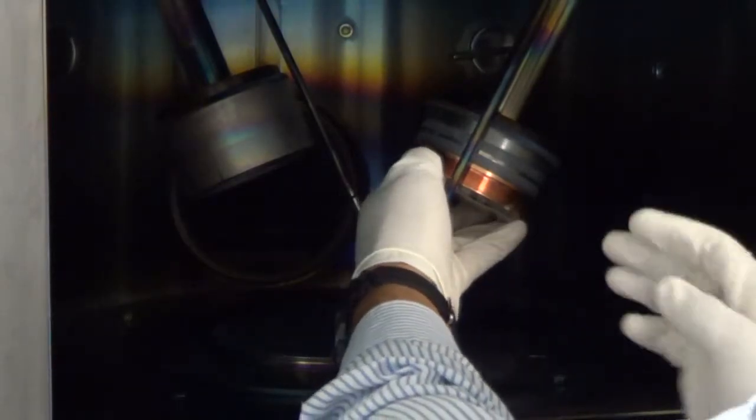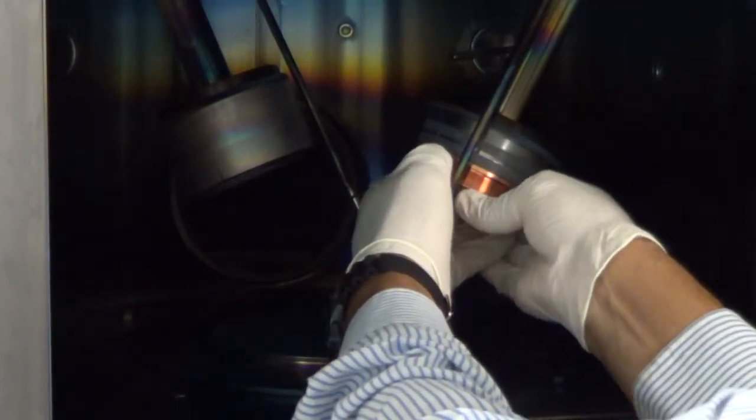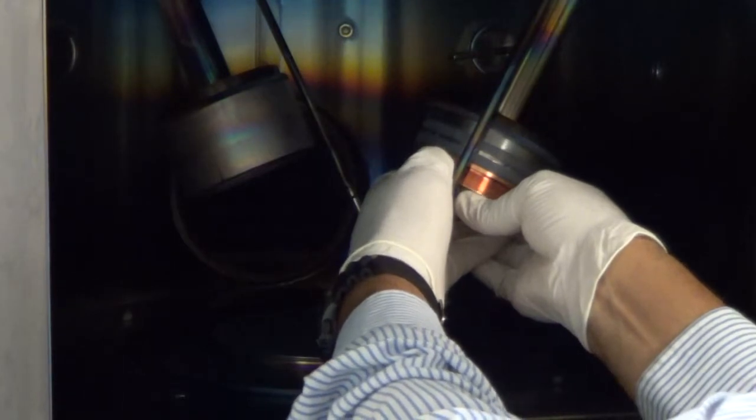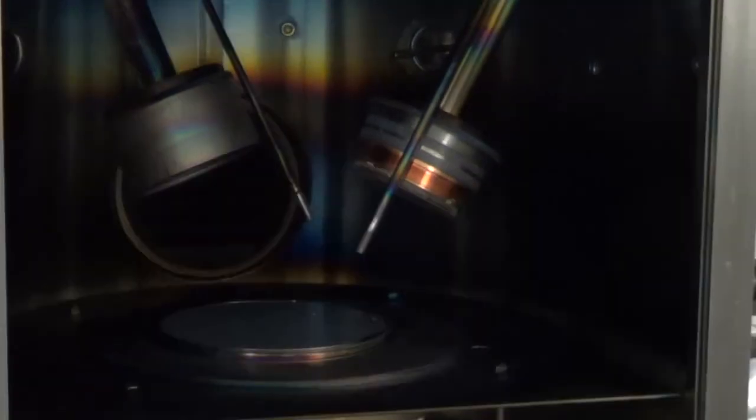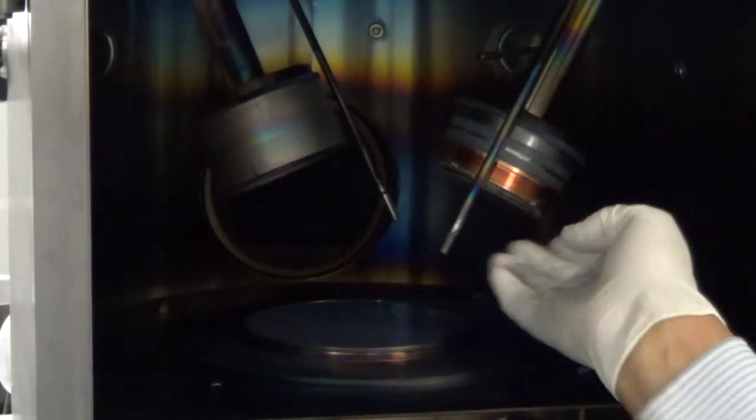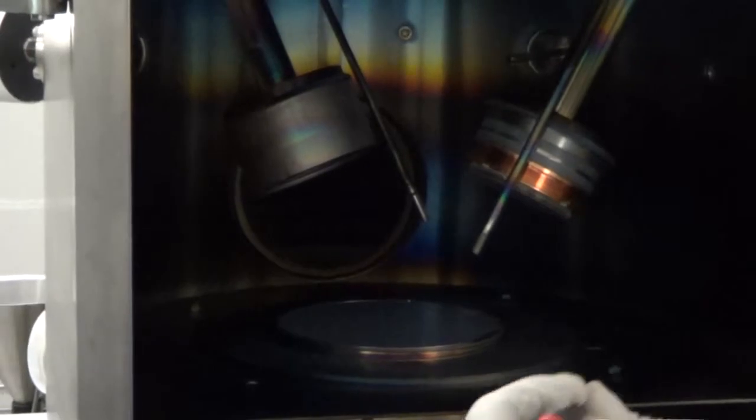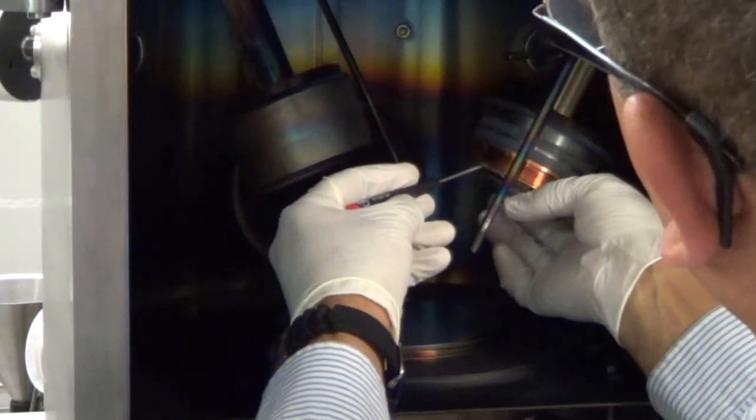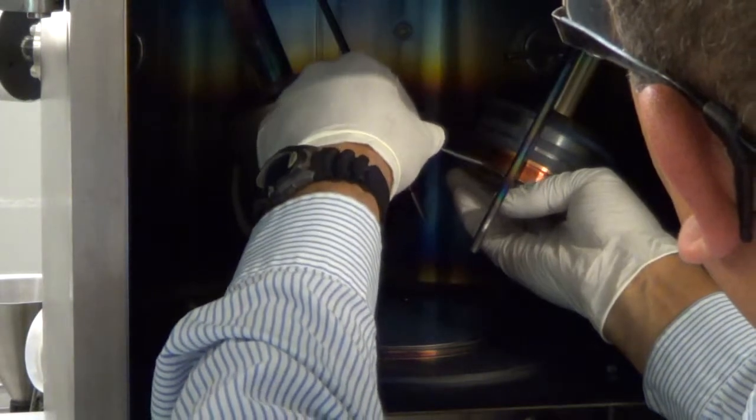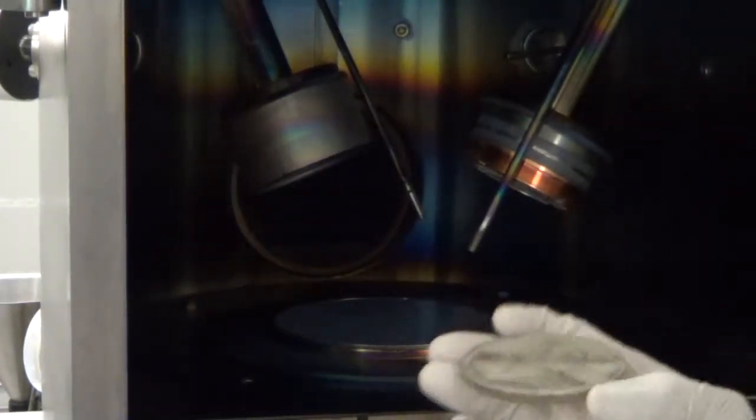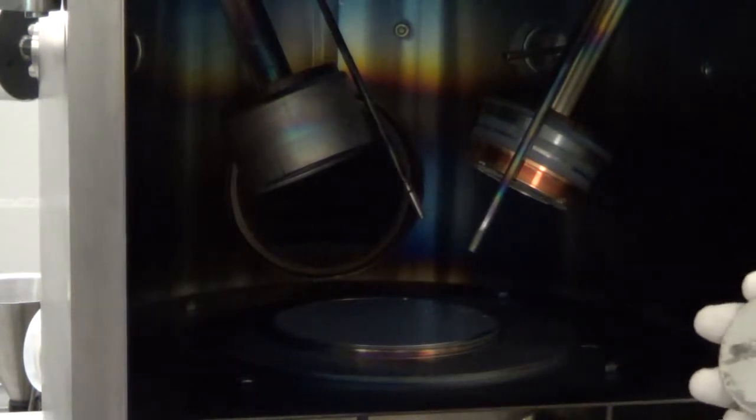Next, what you do is you just remove the target material. Sometimes a small screwdriver is required because the target is adhered to the cathode with soldering paste. It's sticky. The screwdriver is gently inserted. The target is easily removed. You can see this is an example of the indium paste.